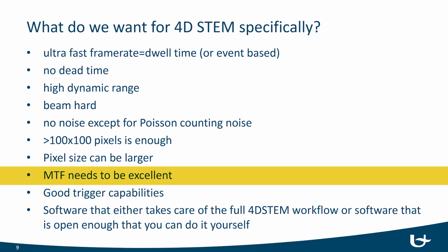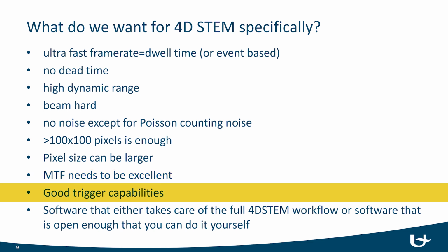And that's important. Then you also want good trigger capabilities, because you will want your scan engine, the probe, moving step by step.